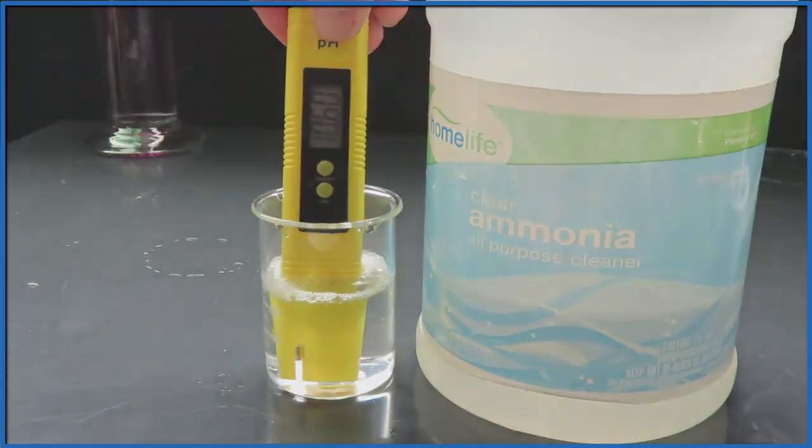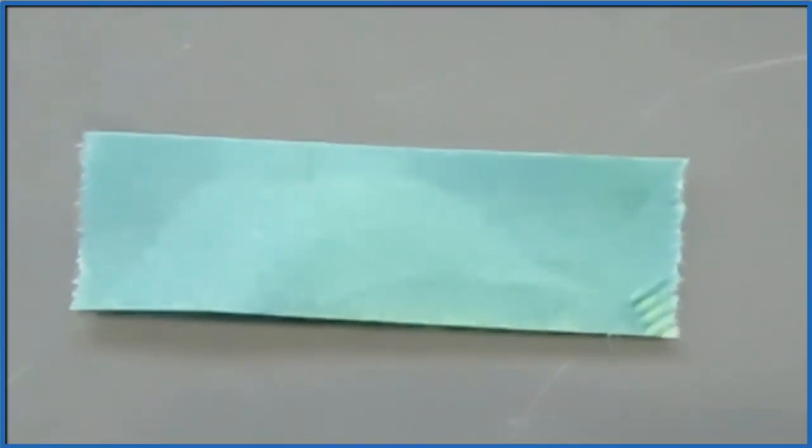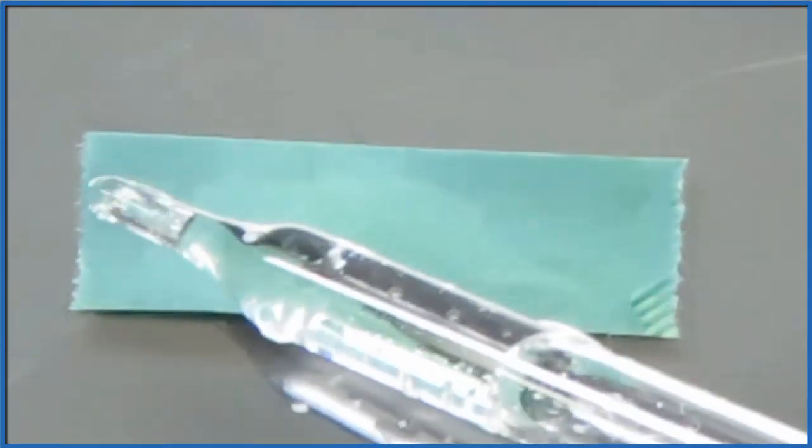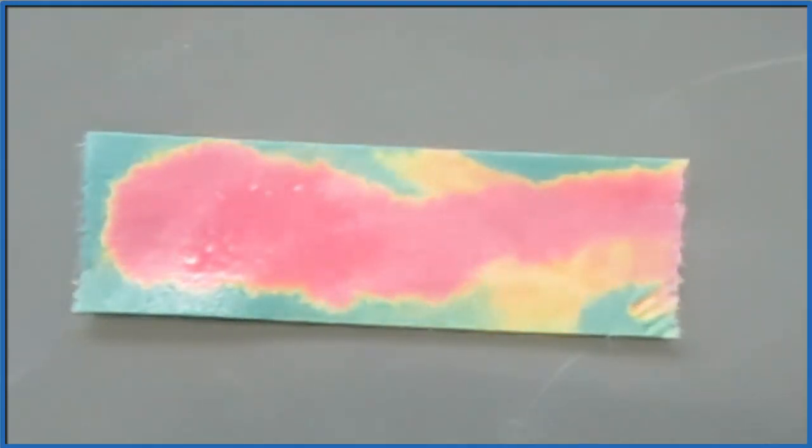If we take that piece of pH paper and put hydrochloric acid on it, it turns red. So the red is where it's an acid and then the green, the bluish, that's the base, that's where the ammonia was.